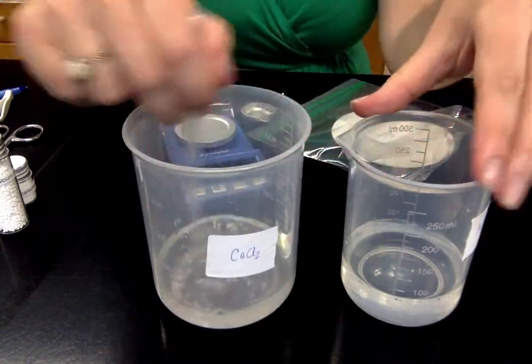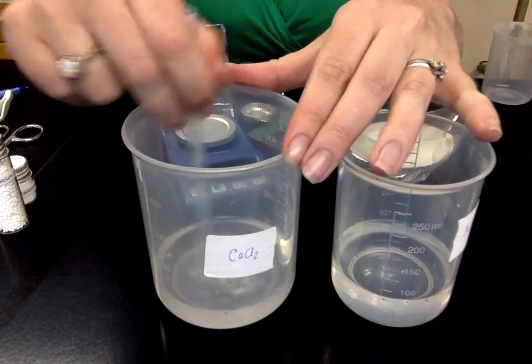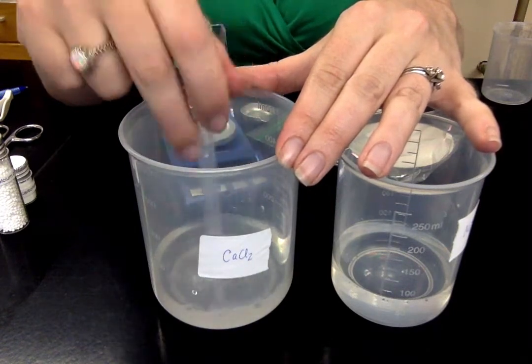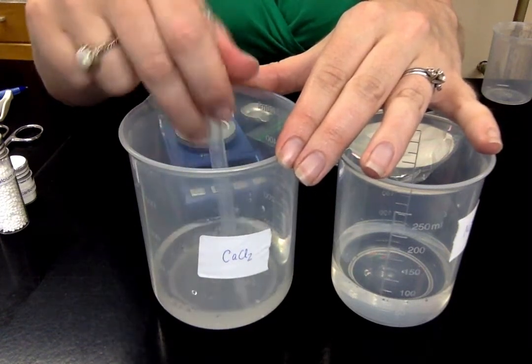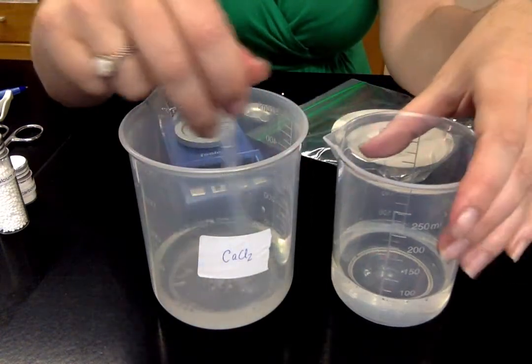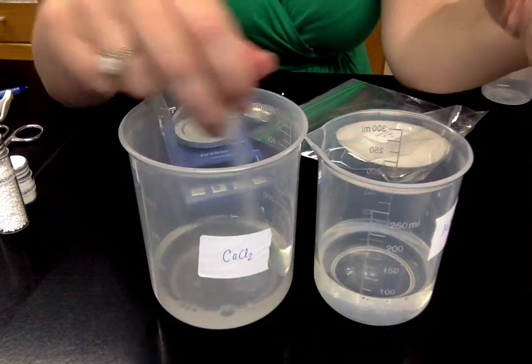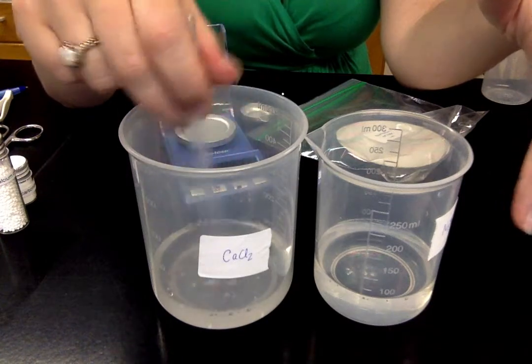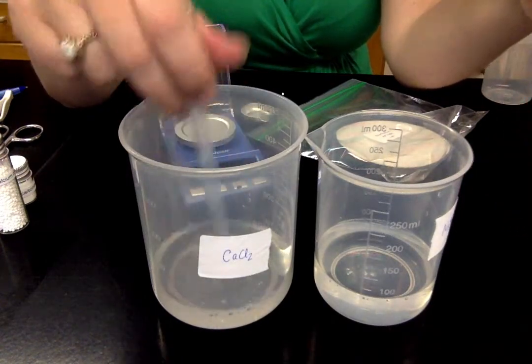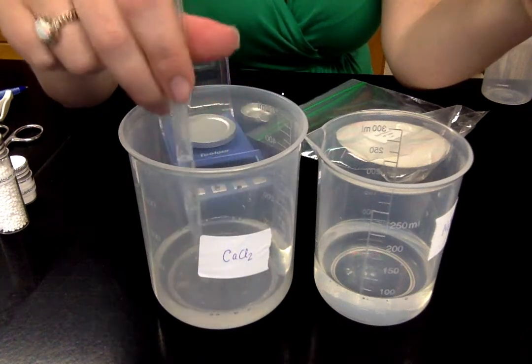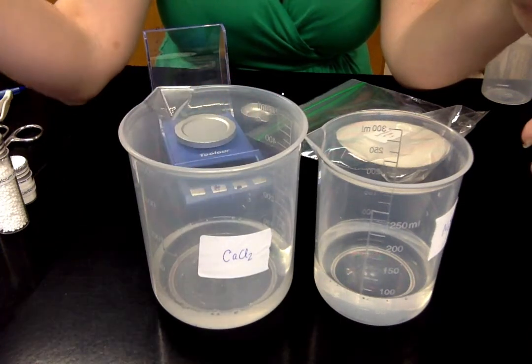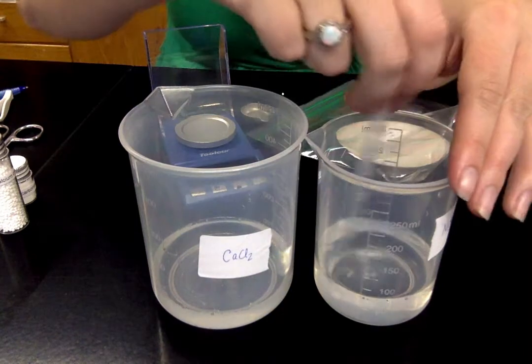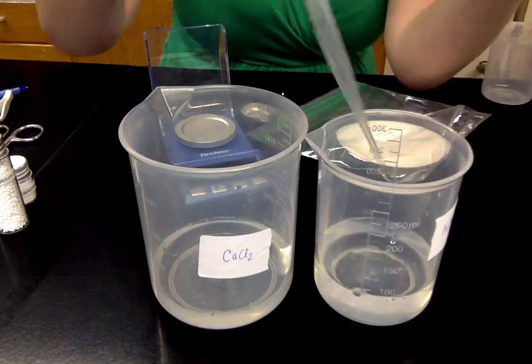So what we have here is two soluble salts. Two different soluble salts are dissolved in two different solutions. And what happens when we mix them together is we end up forming an insoluble salt. And that is a precipitation reaction. So we're performing a precipitation reaction and we're going to calculate, do some stoichiometry calculations. We're going to figure out how much of that precipitate we expect to get. And we're going to actually weigh and measure that precipitate to see how much we actually got. So we'll get an actual yield and we'll calculate a theoretical yield.